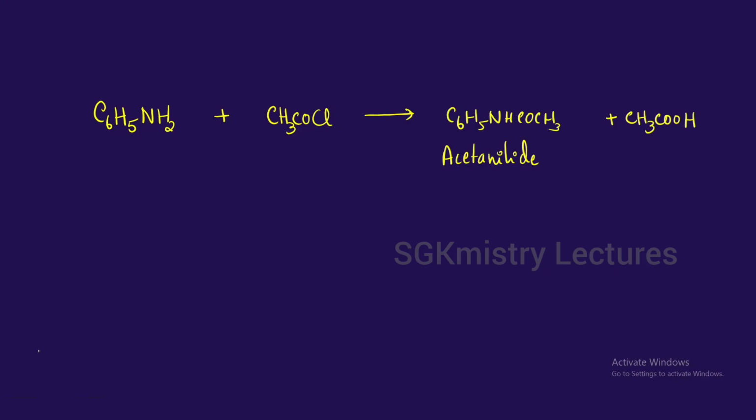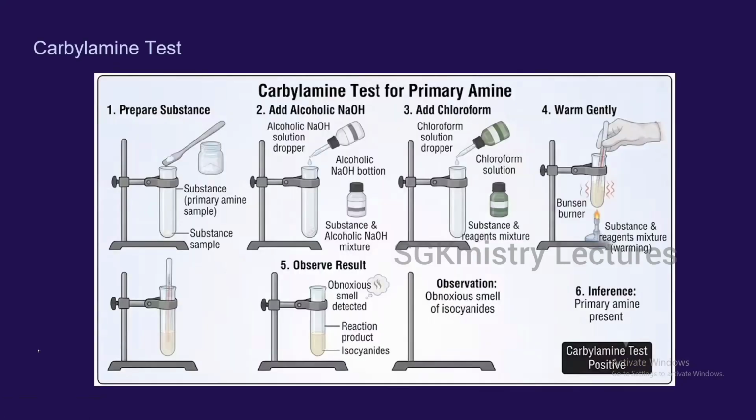So next test is carbylamine test. So this also we should perform very carefully. And one more thing is that usually in the laboratory, they don't go for performing this particular test because it gives out a very obnoxious smell, as well as we can say that it is a strong smell. Okay, so this particular test is avoided, which is to be performed in the laboratory. So you can directly write what is the test along with the principle of the same.